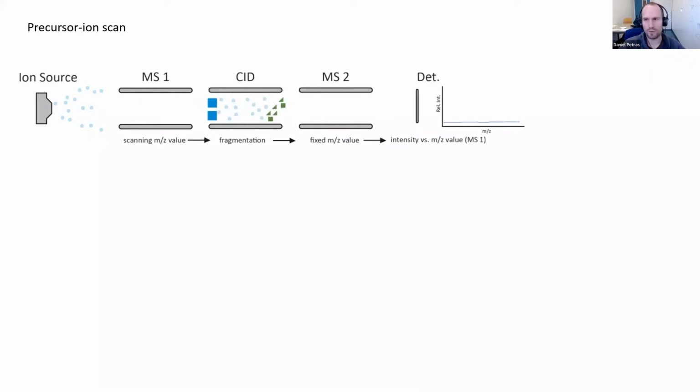And this is very useful when you, for example, know, oh, I do a certain derivatization and this results in the addition of this group, and that results in a specific fragment. Or if you look for natural products and you know from genome mining, oh, there's this N-terminal amino acid and it must be in there, right?